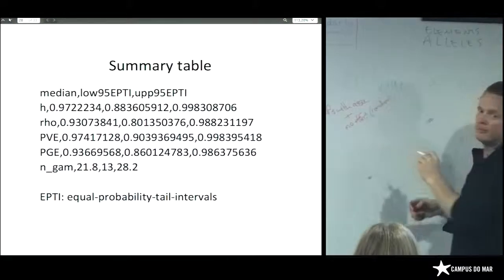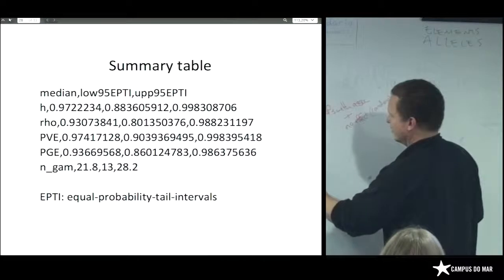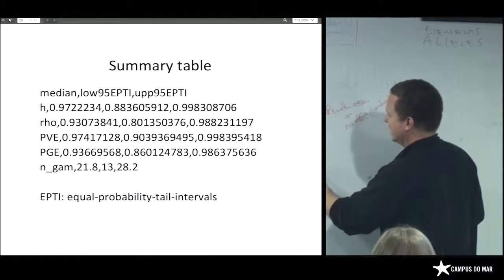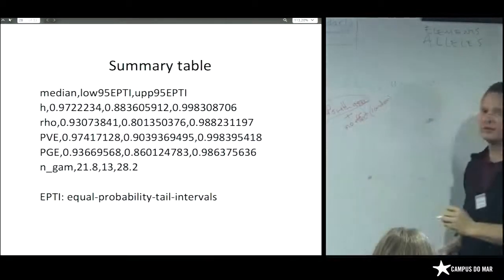Okay, so including random effects is PVE. PGE is only those.